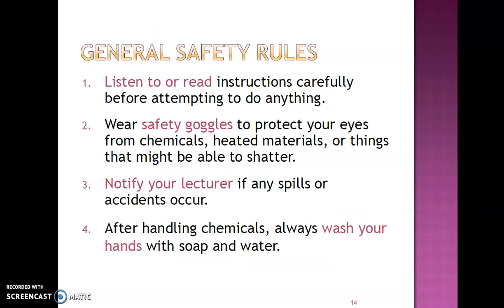General safety rules. Listen to or read instructions carefully before attempting to do anything. Wear safety goggles to protect your eyes from chemicals, heated materials or things that might shatter. Notify your lecturer if any spills or accidents occur. After handling chemicals, always wash your hands with soap and water.